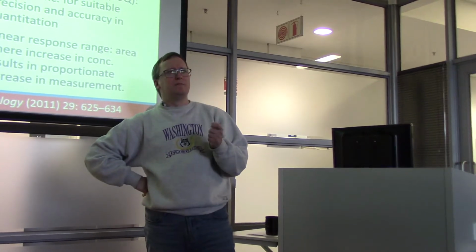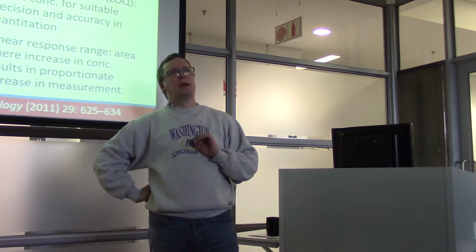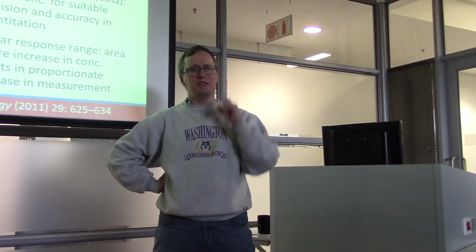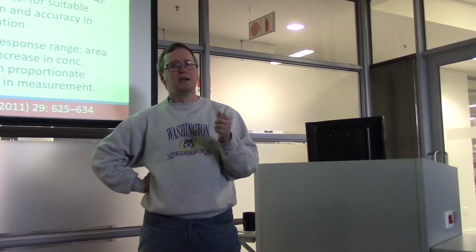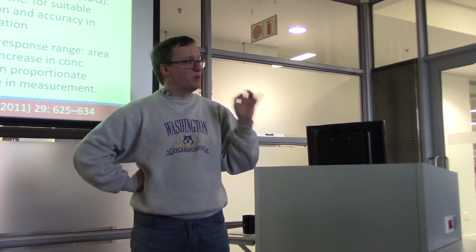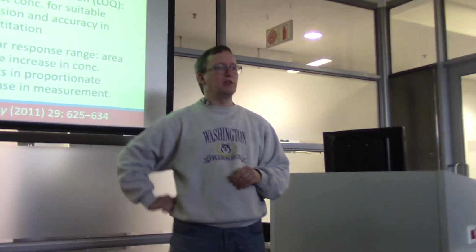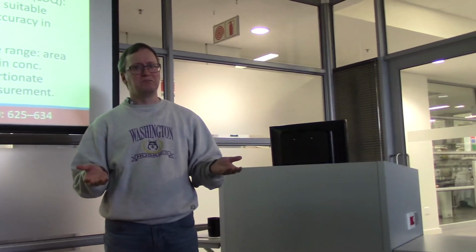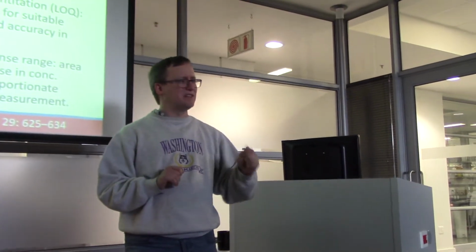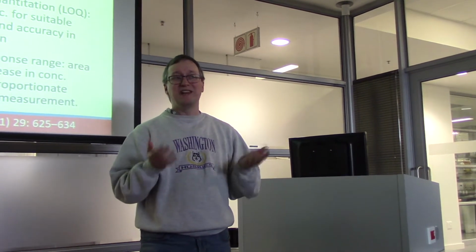I want you to imagine that you are looking for 50 human proteins, and so you have 450 transitions corresponding to those 50 proteins for 150 peptides that you're going to go looking. But let's be crazy for a minute. The samples we're going to use to look for those human proteins don't have them present at all. Let's say we're looking in yeast for a bunch of human proteins. Well, the human proteins aren't there, so wouldn't it be nice if the mass spectrometer gave you an intensity of 0 for all the peptides you saw for all of those proteins? That would be great, wouldn't it? But that is not reality.